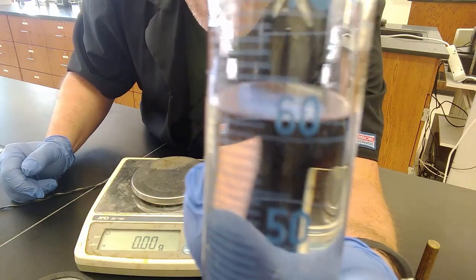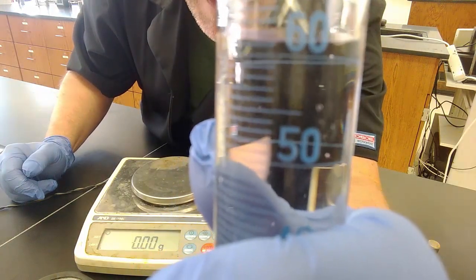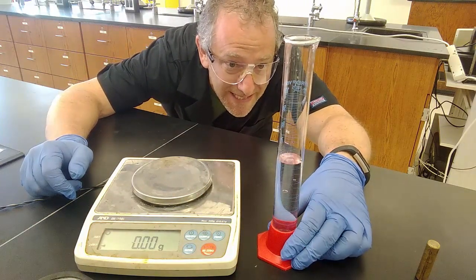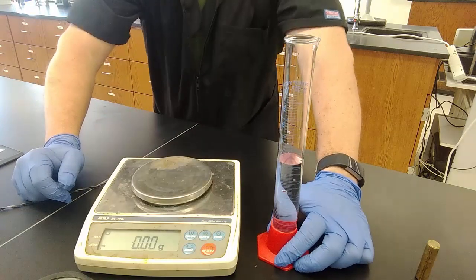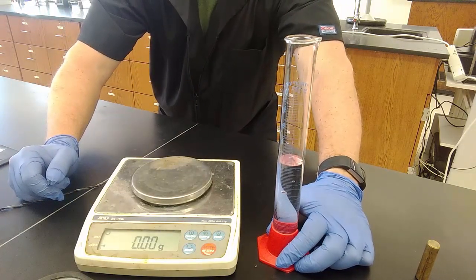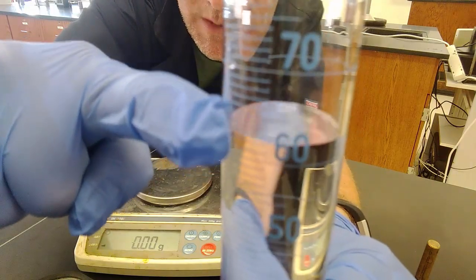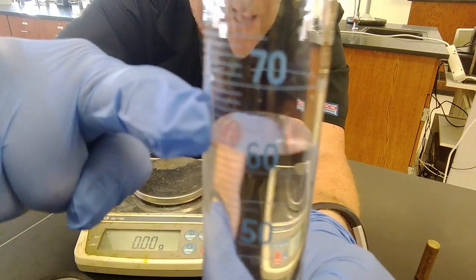Now if we looked really carefully, and it's going to be hard for you to do this because I can't get this exactly at eye level, at camera level. If you look really carefully, and I'm going to get my eye level down to it, it is between the 62 and the 63 milliliter line. Really close to the 63 milliliter line, but between 62 and 63. I cannot just write down on my data sheet 60, 61, 62, 63. It's close to the 63 line. I'll call it 63. That's blowing our precision.